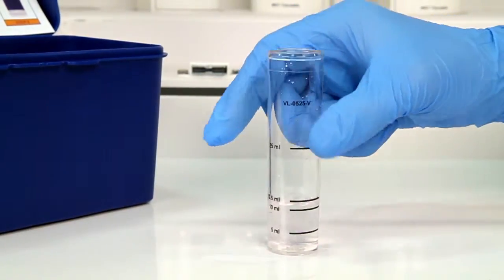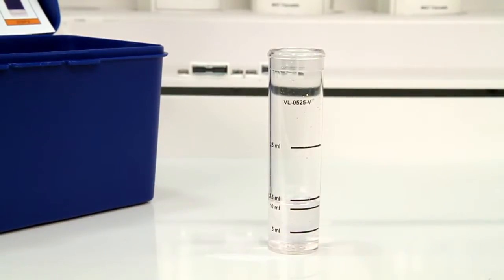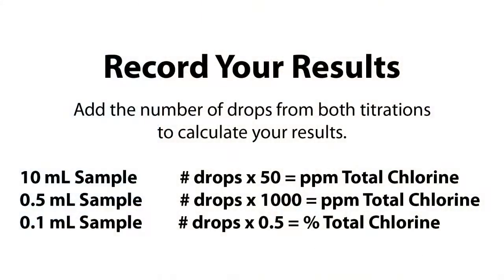Add the number of drops from this titration to the number of drops from the first titration. Multiply the total number of drops by your chosen equivalency factor to determine the parts per million total chlorine.